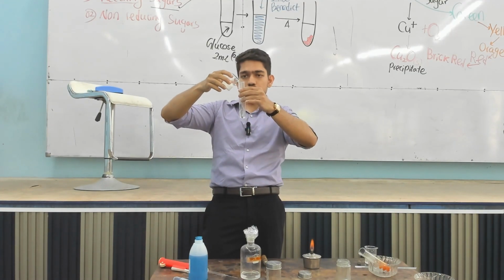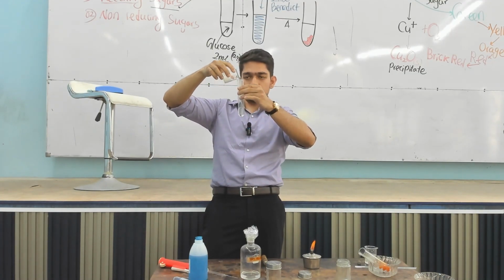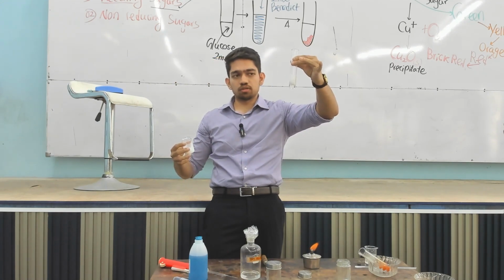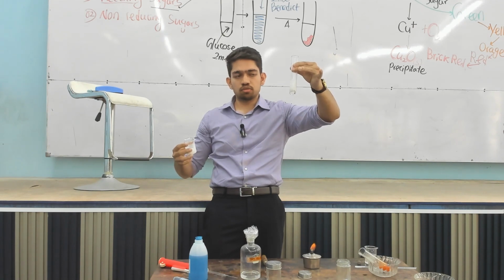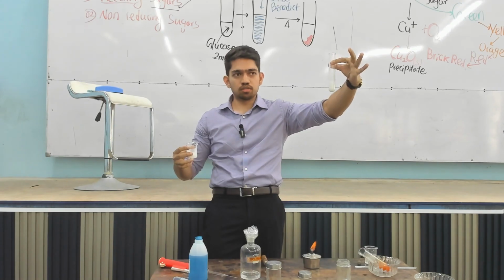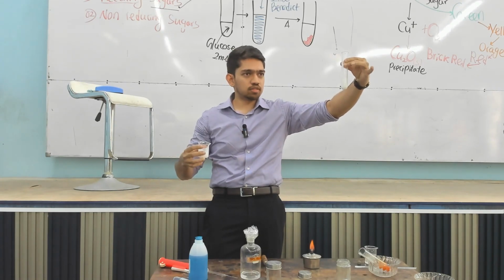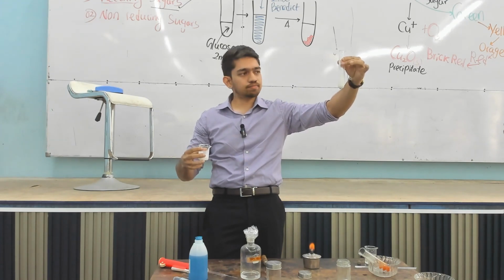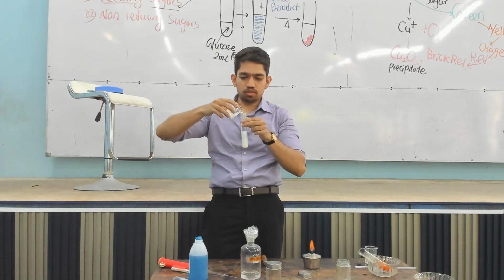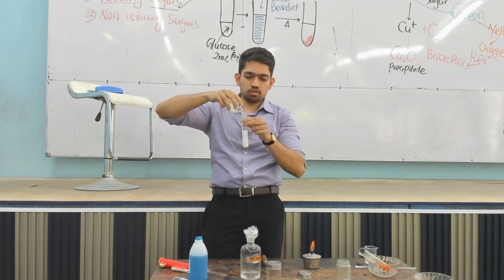So we should neutralize this with the bicarbonate. Can you see, it's an acid base reaction, I can hear the whizzing sound. It's an acid base neutralization reaction, right? There's going to be what? Carbon dioxide gas. Okay, that's because the acid is a bit too concentrated.